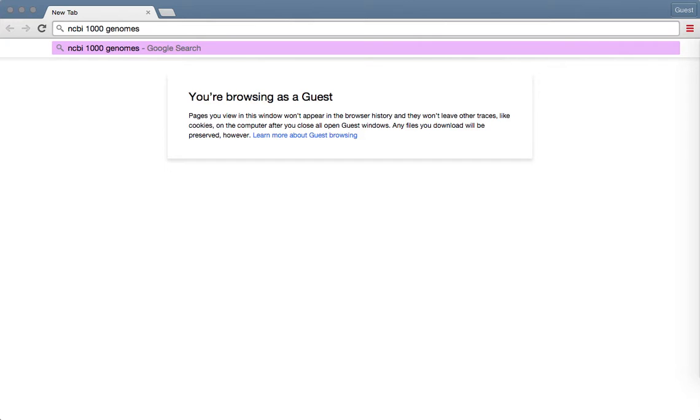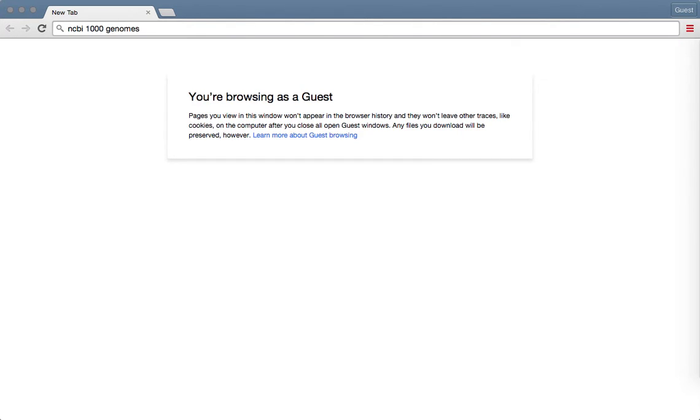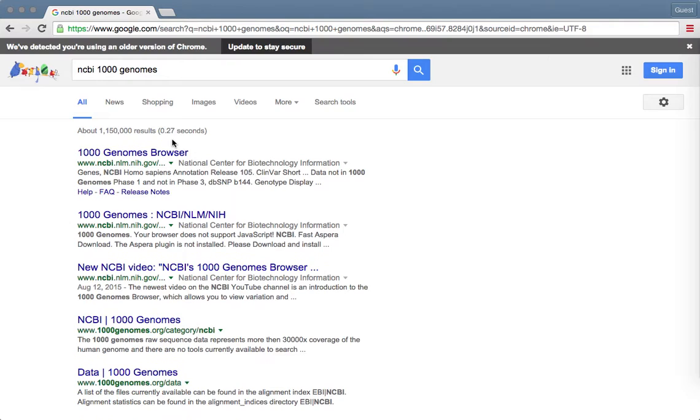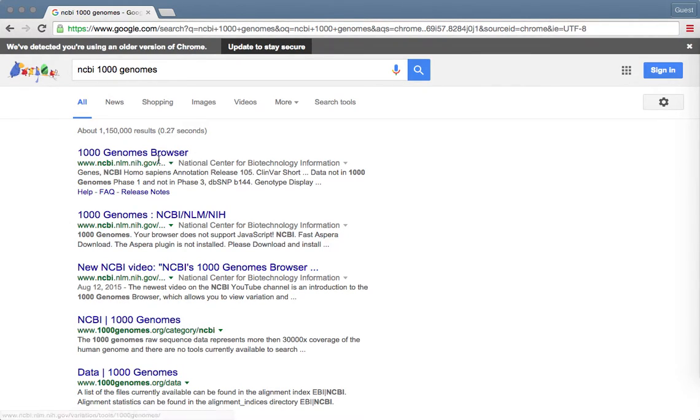After typing that, hit enter. The link we want is going to be the first link, 1000 Genomes browser from the National Center for Biotechnology Information.